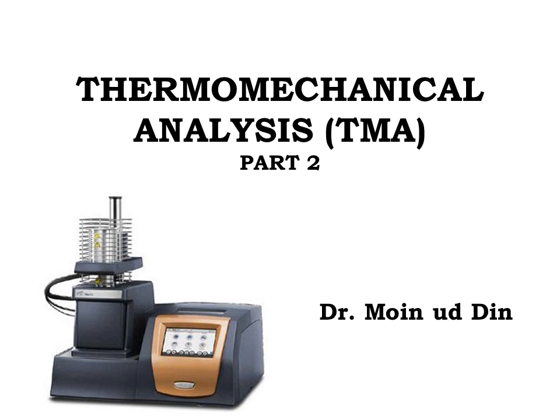In part 1 we have discussed the basic introduction of TMA, then we have seen the history and principle of this technique. We have also seen there the complete instrumentation of thermo-mechanical analysis.